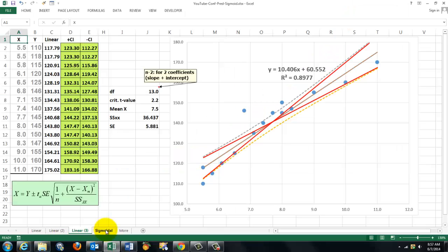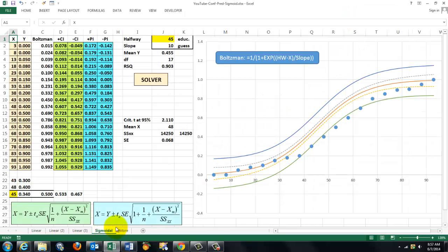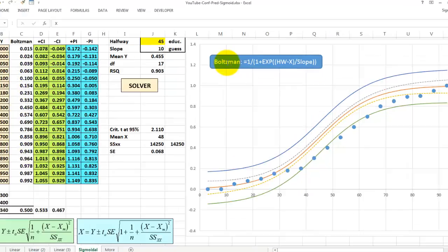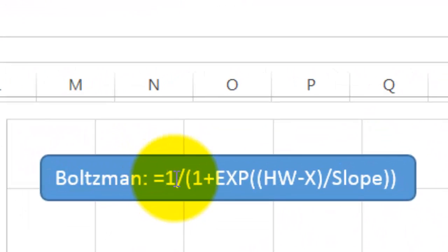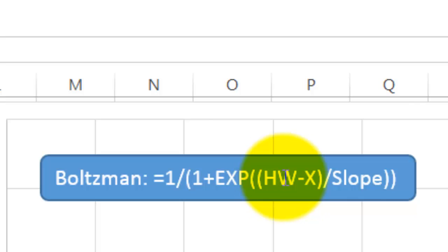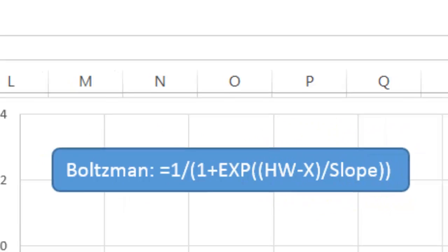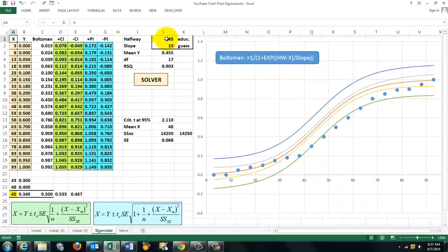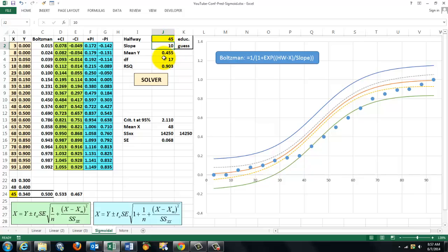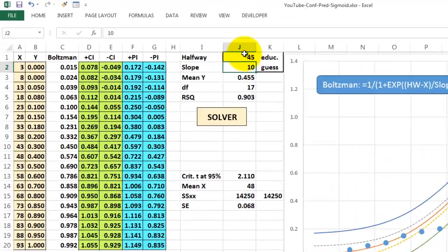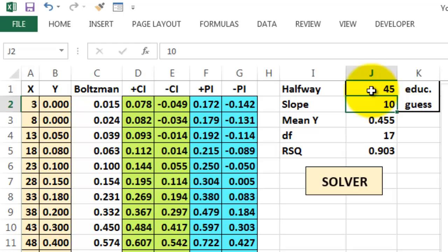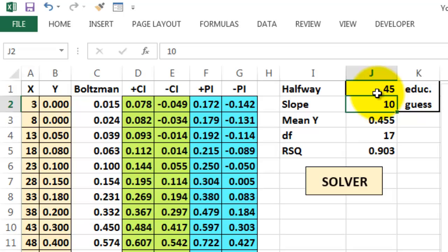Similar story for sigmoidal. It's a little more complicated because Excel doesn't do that on its own. The sigmoidal one can be done with the Boltzmann equation, which I put here. It has two variables, the halfway value and the slope value. So these are my two parameters for that equation. I don't know whether they are correct, so it's an educated guess, and I will later on make it better.